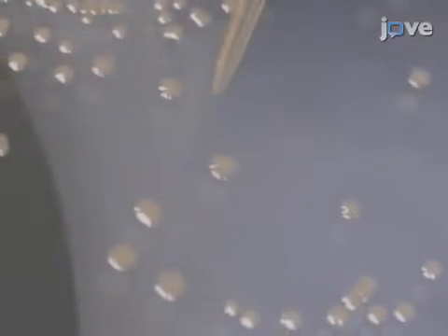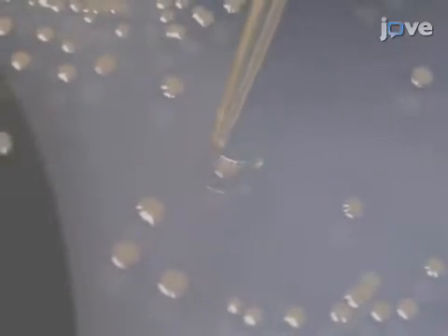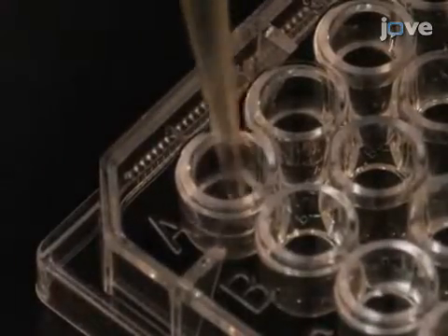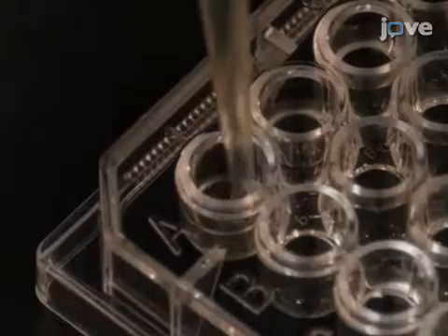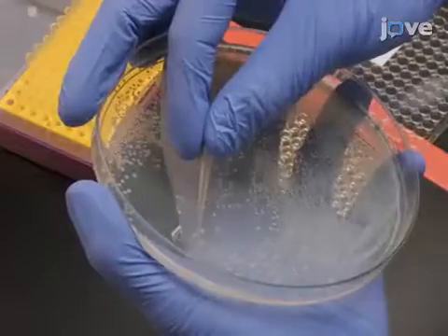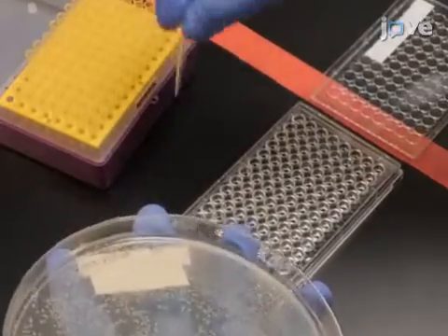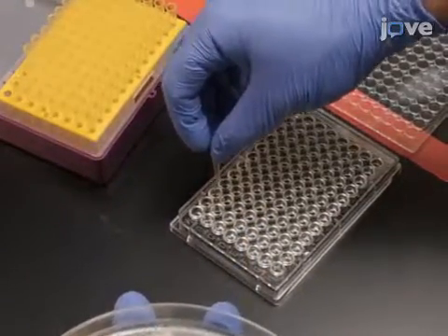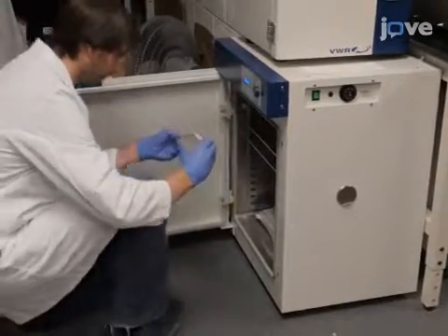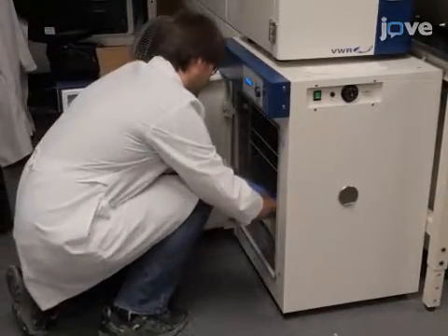With a pipette tip, pick an individual colony from the agar plate. Then place the tip in the first well of the 96-well plate and gently stir to inoculate. Continue to inoculate one colony into each well. Incubate at 37 degrees Celsius for 20 to 24 hours on a microplate shaker.